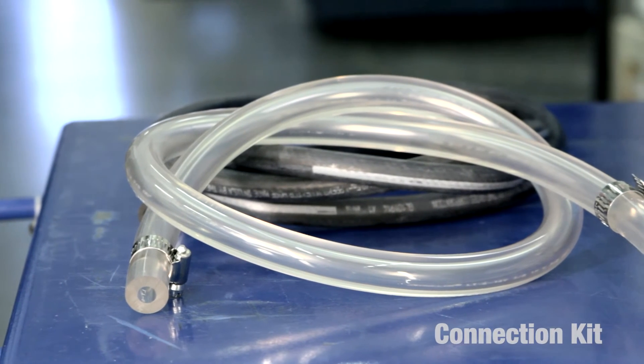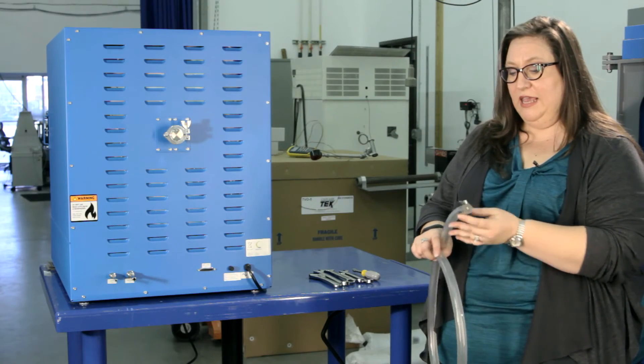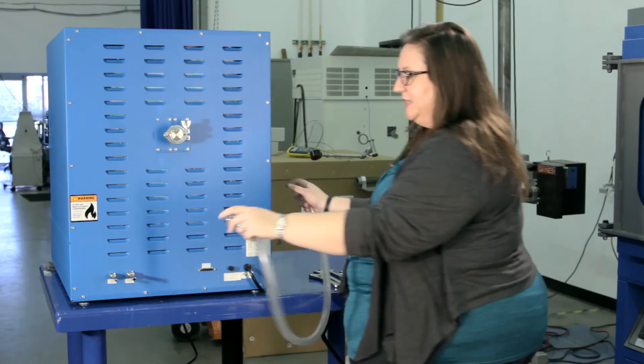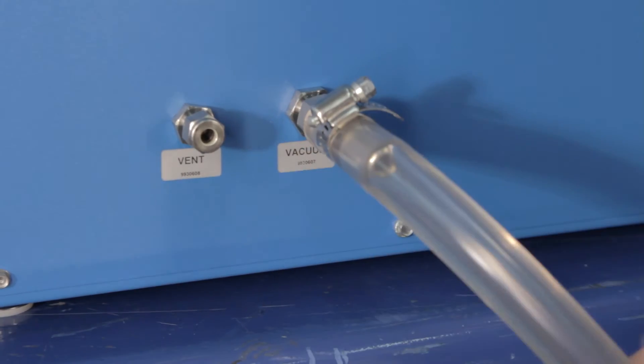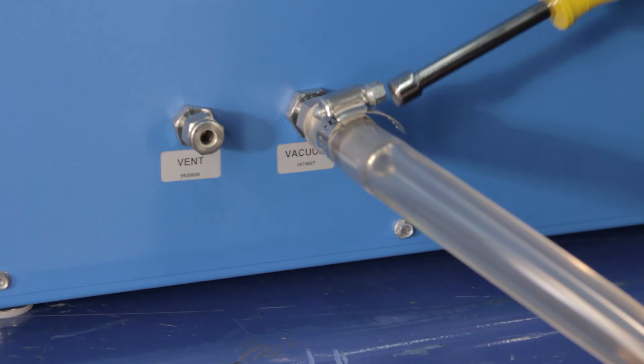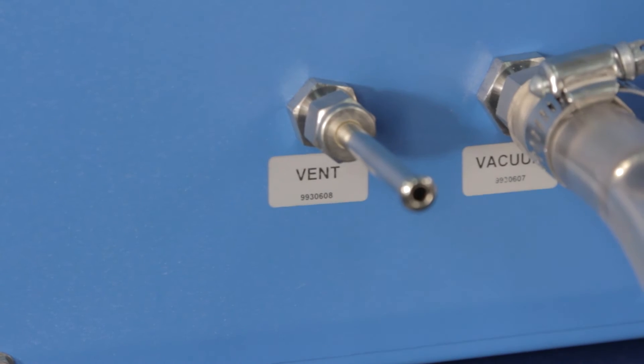In your connection kit, you received vacuum rated tubing with a little hose clamp. Simply slide this over the vacuum stub and use your quarter-inch nut driver to tighten that hose clamp.